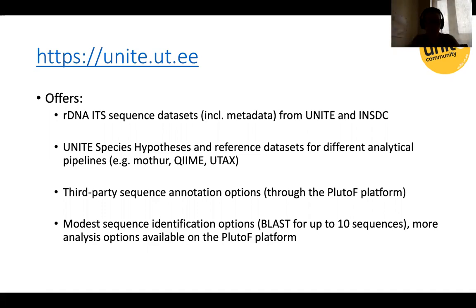This means that although in GenBank a sequence might be incorrectly identified, in UNITE you can add correct identification or any kind of metadata to this sequence, and later these identifications will end up in the reference datasets that people can download and use for their in-house analysis. There are modest sequence identification options available on the UNITE homepage. It's BLAST analysis for up to 10 sequences, but more analysis options are available on the PlutoF platform.